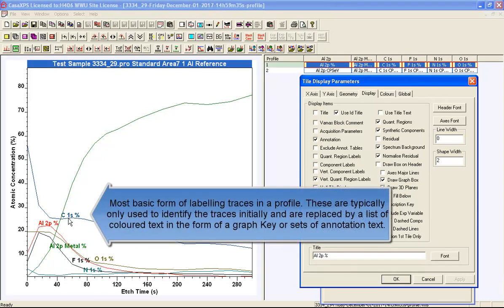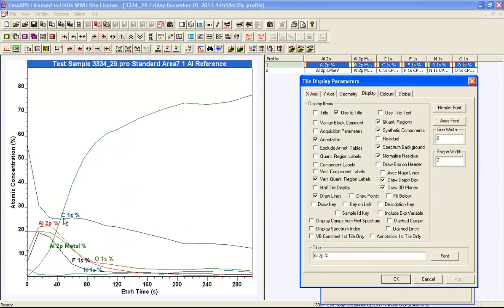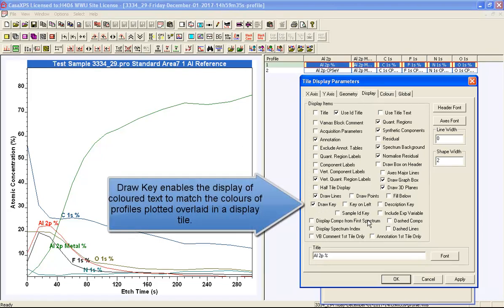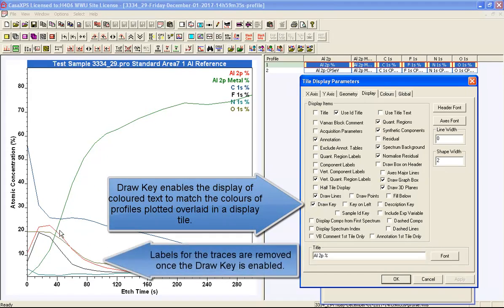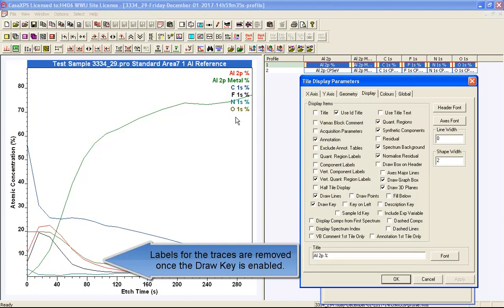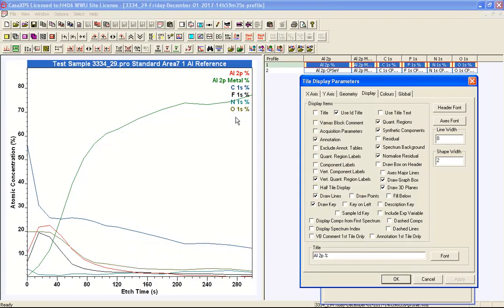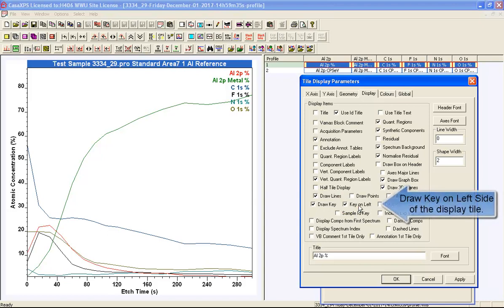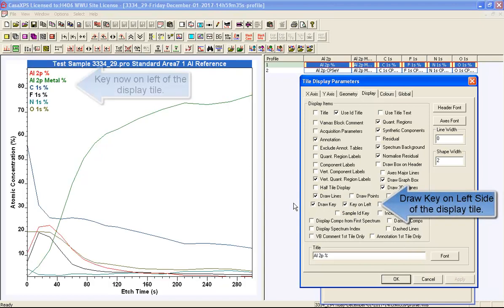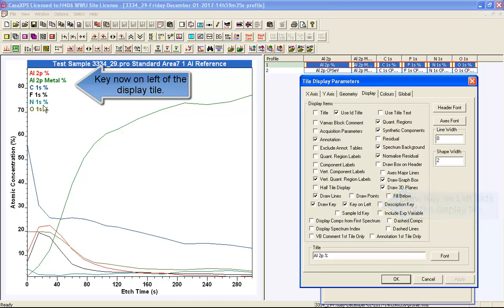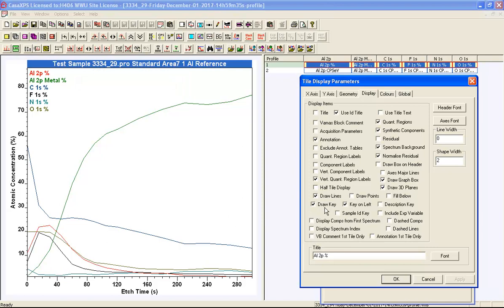The VAMAS block identifiers label the traces in the basic method, simply indicating what the traces are. If you want a legend-style display, you can enable 'Draw Key,' which removes the labels from the traces and shows them ordered in a key on the right-hand side. There is also a 'Key on Left' button, which moves the key to the other side. Both buttons disable the display of inline trace labels.